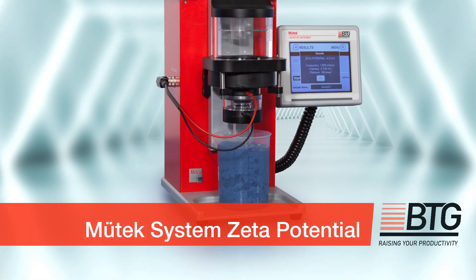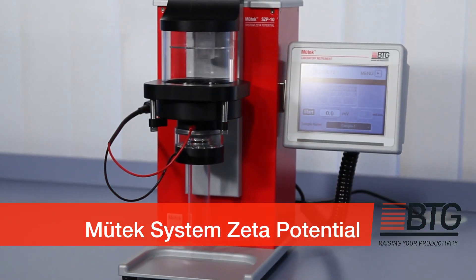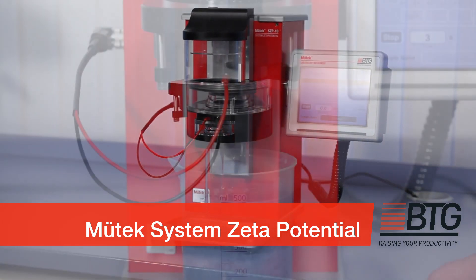The MUTEC system zeta potential, or SZP for short, measures charge of the solid fraction in a solid-liquid suspension.